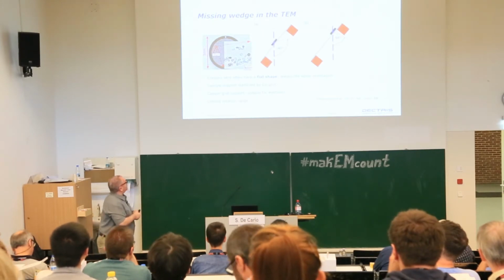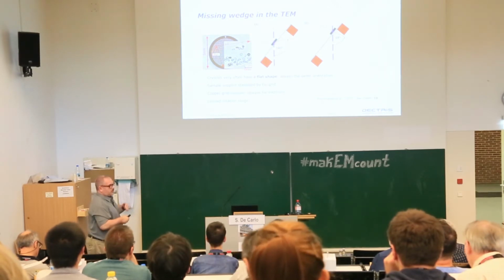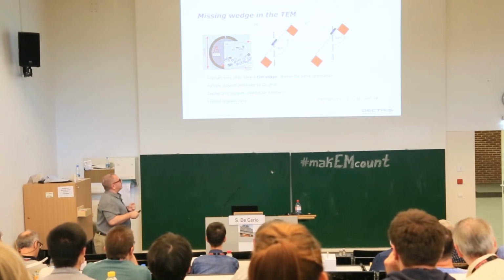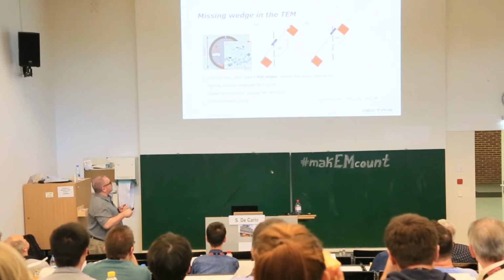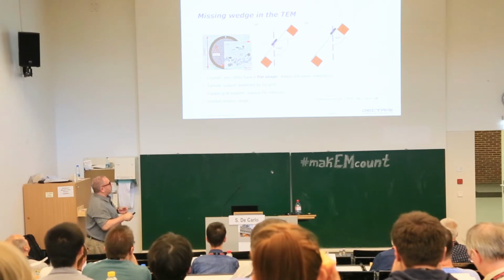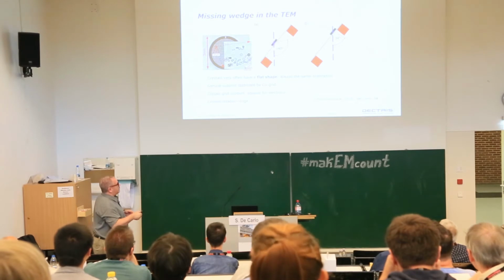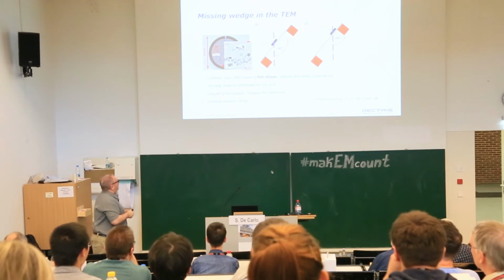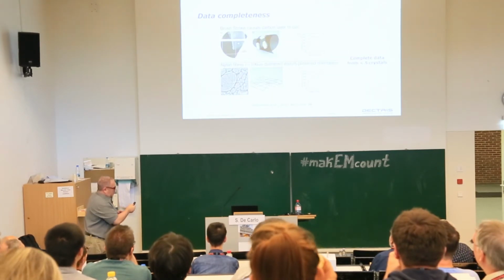So what is important is that your crystal is first of all adsorbed onto a thin carbon film, so it has the tendency to lie flat and show one typical crystal direction. And while you tilt the beam, the position of the crystal on this film also has to be somewhat ideal, because if it's too close to the copper wedge of the grid support, then you might have a limited angular space to cover. So there are obviously a few ways to counteract this. I'll come to that in a second.